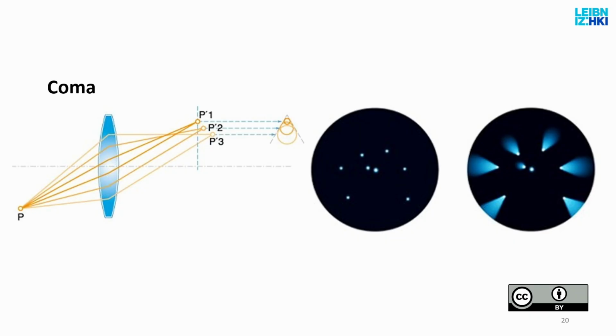If your illumination comes at an angle not parallel to the optical axis, which is a natural occurrence, the focal points will be at a different distance from the lens not only horizontally, but also vertically. So instead of having one focal point, you will have a focal area.